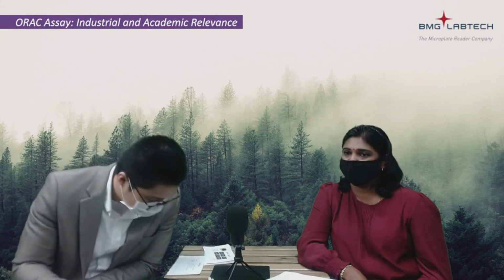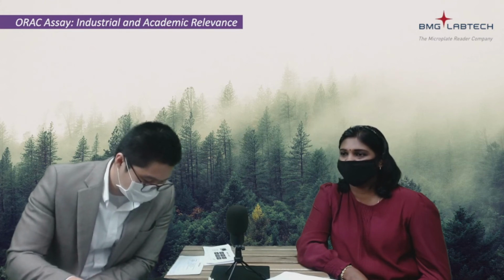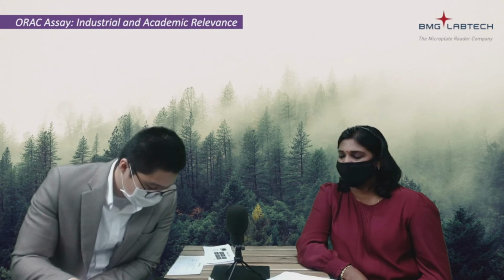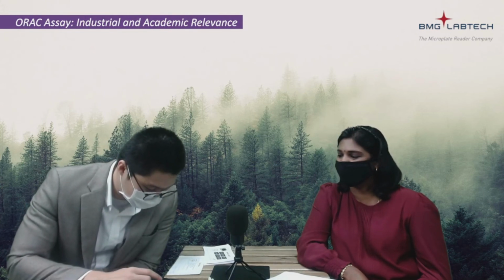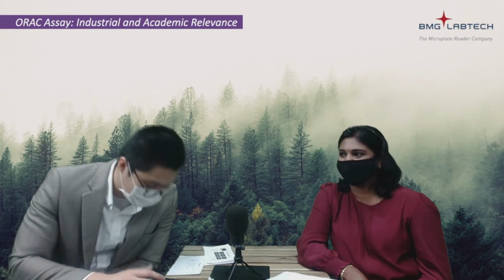One more question. Sorry, that question just now was from Sari C. Thank you again for that question. I hope that answer helps. The last question I have is from Assistant Professor Dr. Bhaskaran Gunasekaran: how long will it take for analysis to be done if we send samples to you? Very important question. Usually it takes about 14 working days to complete, so that's around 2 weeks plus.